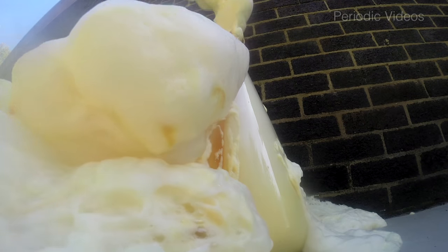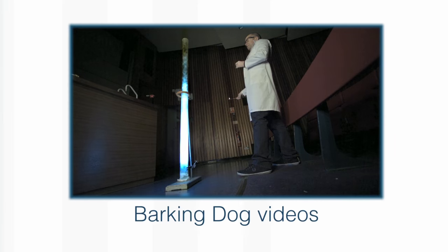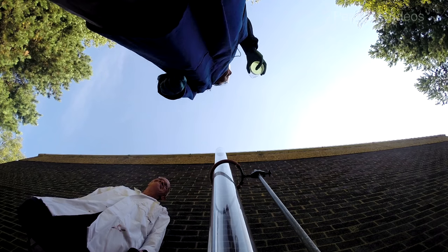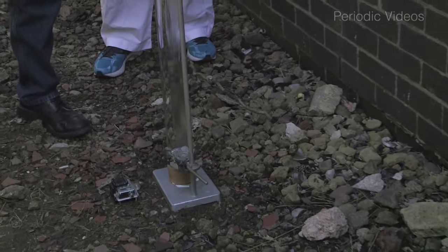I was really excited to see the foam overcoming our little camera at the side. So now we can actually demonstrate that this conical flask is important. Because Sam wanted to do the reaction in one of our big test tubes — our barking dog tubes — which have straight sides. She thought it would be really spectacular. Neil thought it would be a waste of time. In fact they were both wrong. It was not bad, but not nearly as dramatic as in a conical flask.